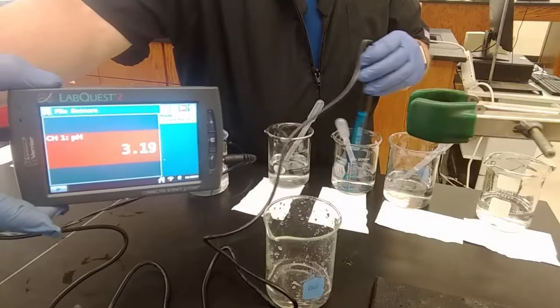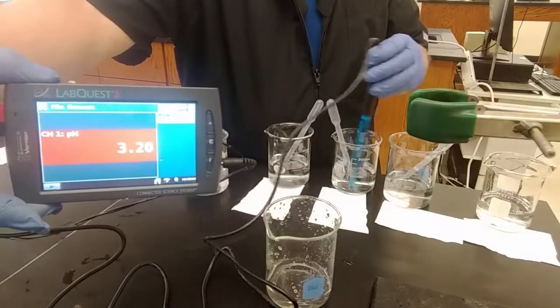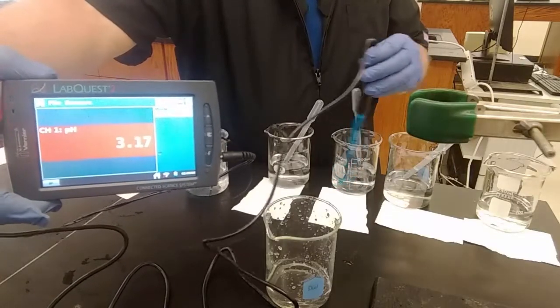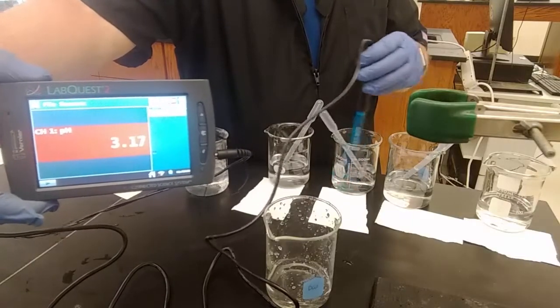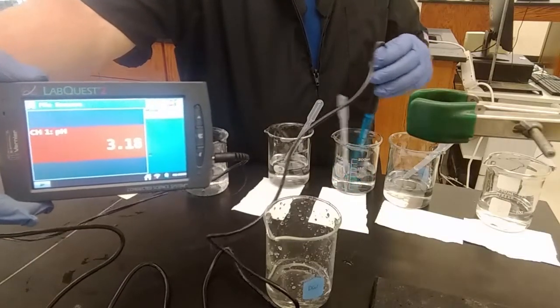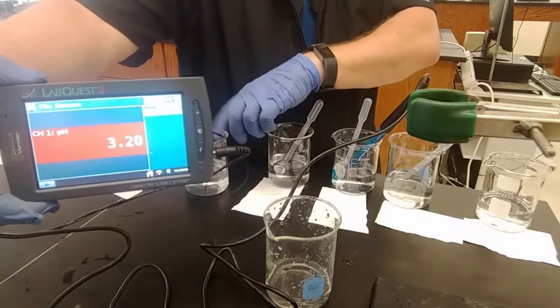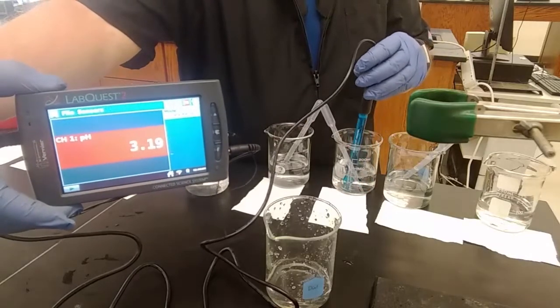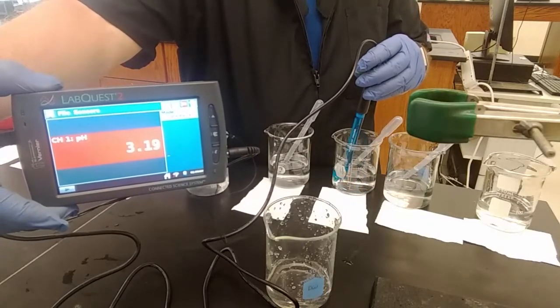The water out of the tap, out of the deionizer, when I refilled the bottle, the deionizer hadn't been used in a while, and it seems like that last water that I added may not have done such a good job of deionizing. And so our pH 7 water was freshly not deionized, and it seems to have been a problem. But we'll check other ways to find out.